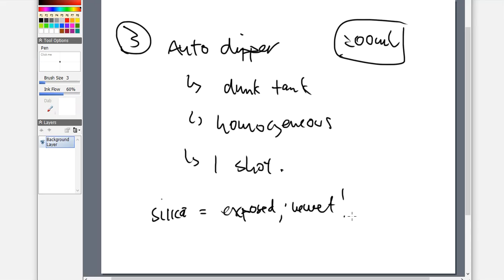You can rake it off. So if you think, oh no, I didn't do it the right way, I need to dunk it a little bit longer, and you go in for a second dunk, there is a chance that you have wetted the silica so much that it's now become so heavy that it will just flop off of the plate and go into the bottom of your dunk tank. It will basically fall off as you're lifting the plate up.